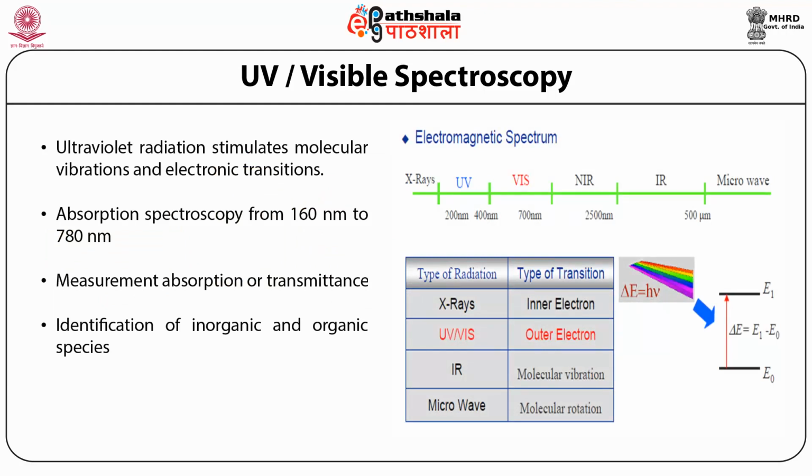The UV visible spectroscopy. When radiation interacts with matter, a number of processes can occur, including reflection, scattering, absorbance, fluorescence, phosphorescence, which is absorption and re-emission, and photochemical reactions, which are absorption and bond breaking. In general, when measuring UV visible spectra, we want only absorbance to occur because light is a form of energy.